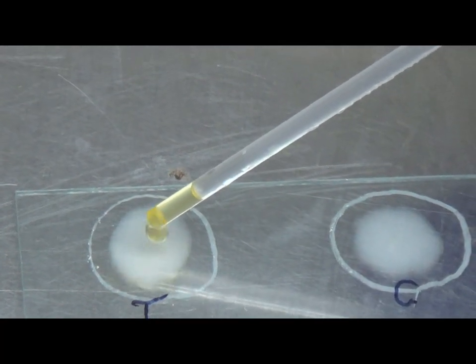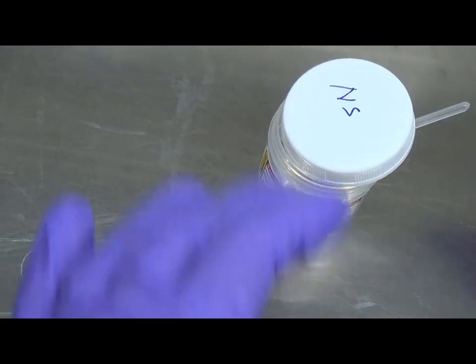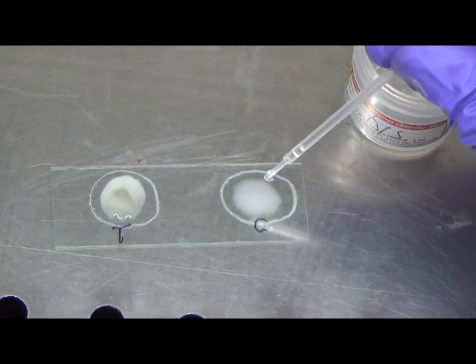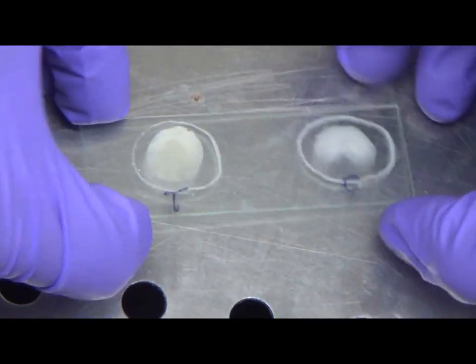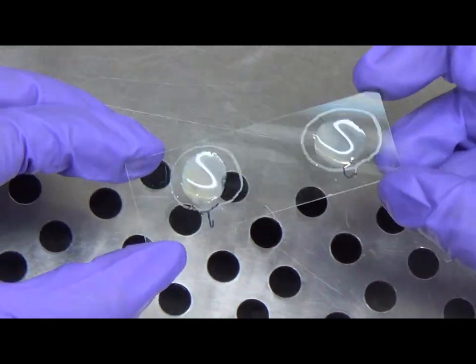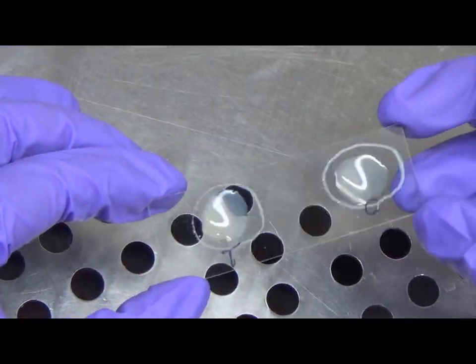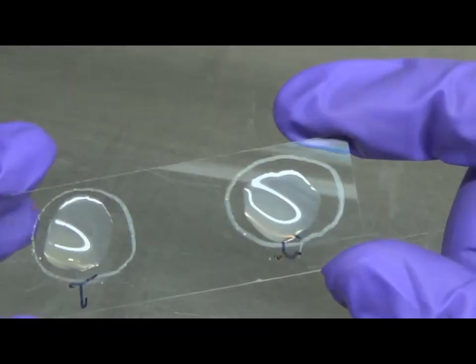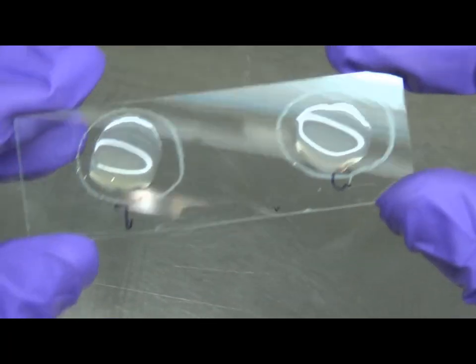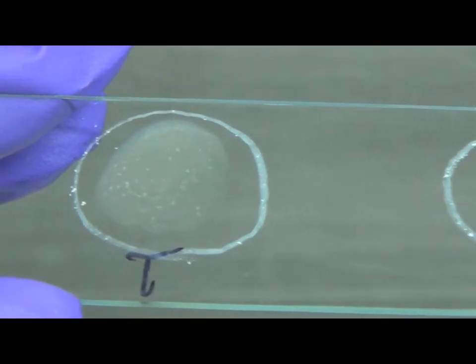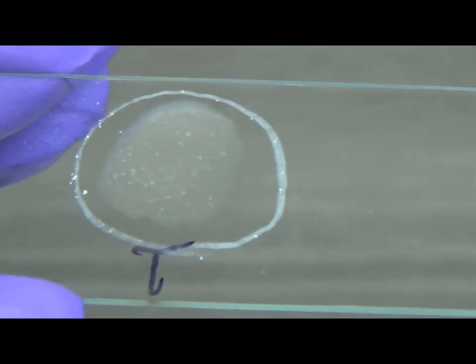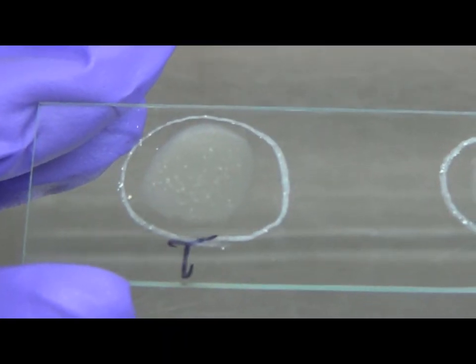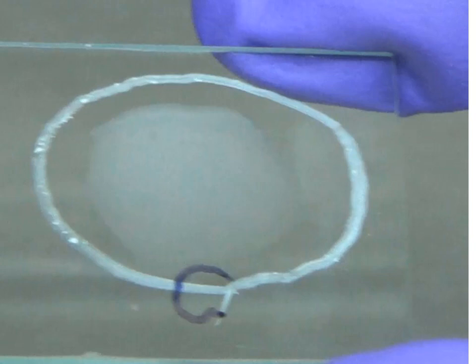Place a drop of sterile saline into circle C. Rock the slide back and forth and observe for agglutination of the test suspension. A positive reaction will be detected within 10 to 15 seconds, and the test is considered negative if no agglutination is observed after 2 minutes. The saline control should remain smooth and milky. If the control suspension agglutinates, the test is uninterpretable.